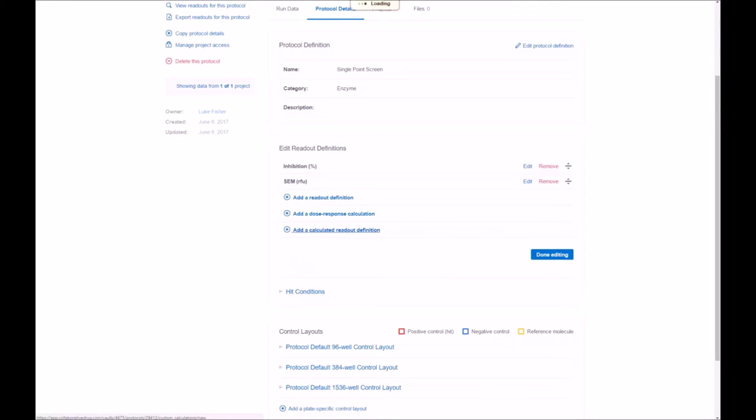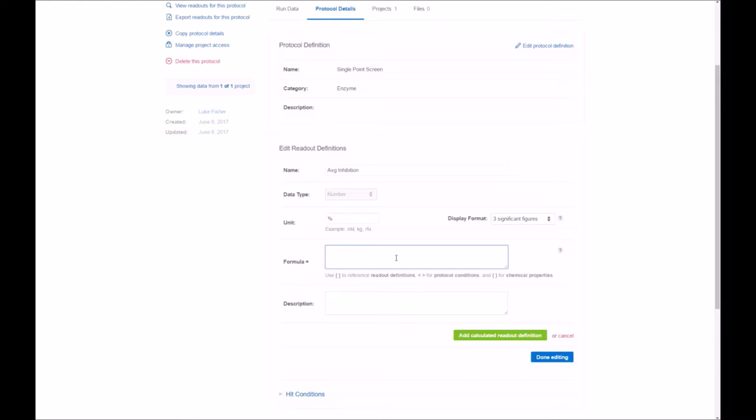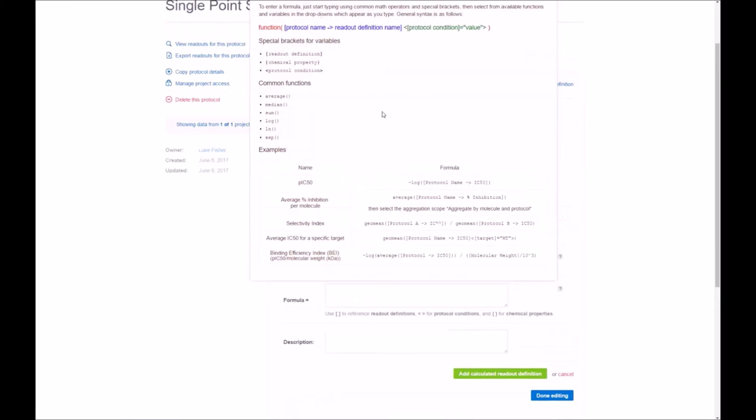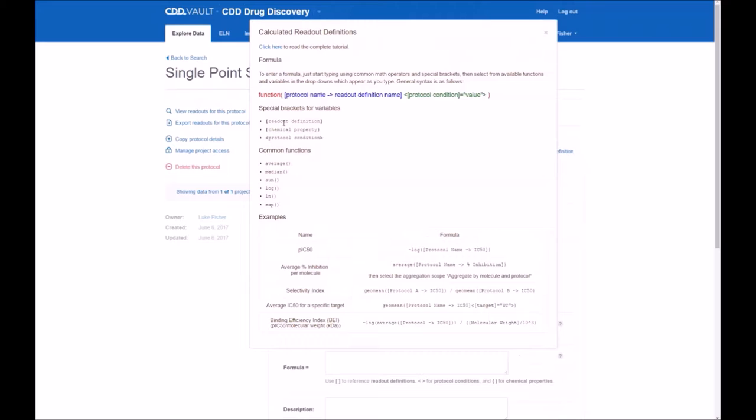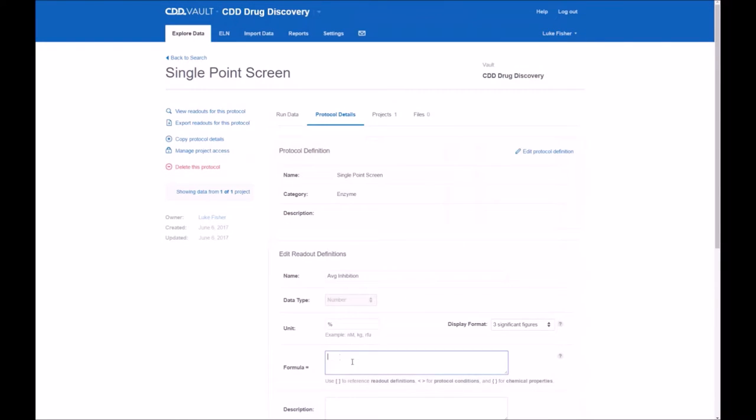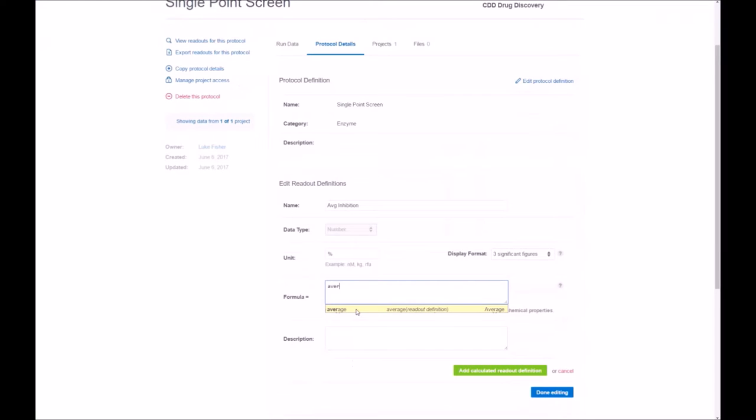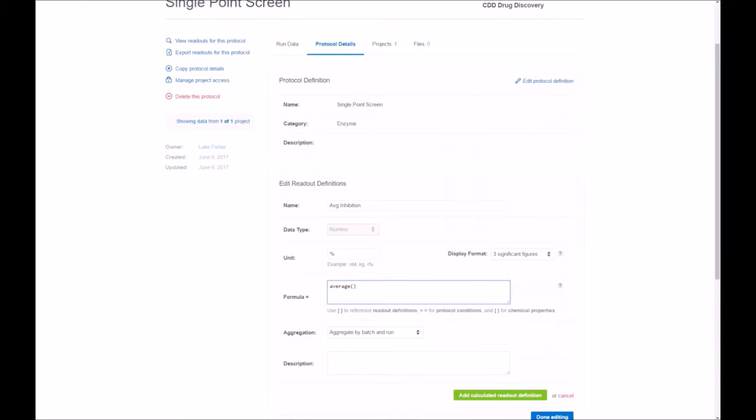Next, we'll do the calculated readouts. Here, we'll use the average inhibition. So we'll give it a name. Unit. The formula editor is available. This question mark here provides some really helpful information. So please utilize that of the different types of terms available and as well as how to use the logic in the formula editor. We'll start just by typing ahead average. That'll be auto-selected in yellow. And the left bracket will show you all the different readouts available.